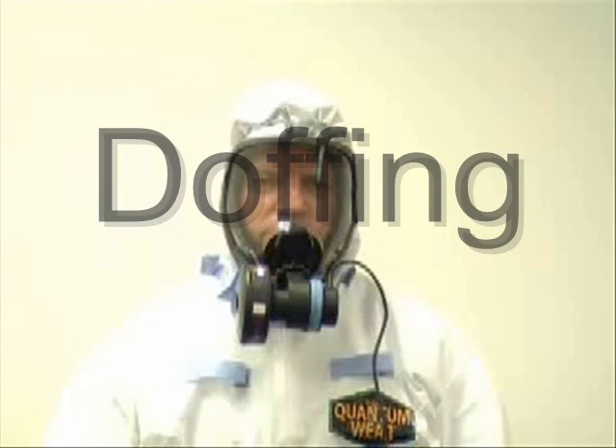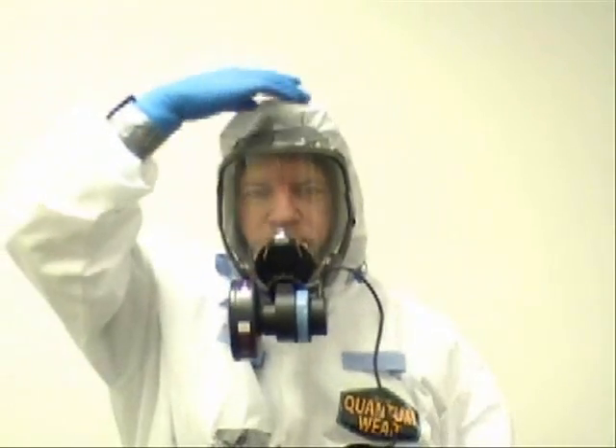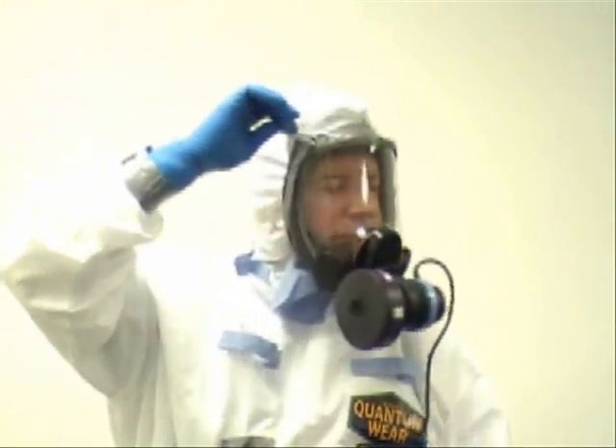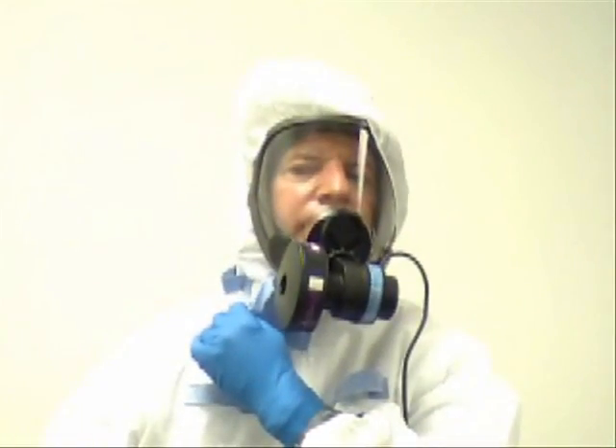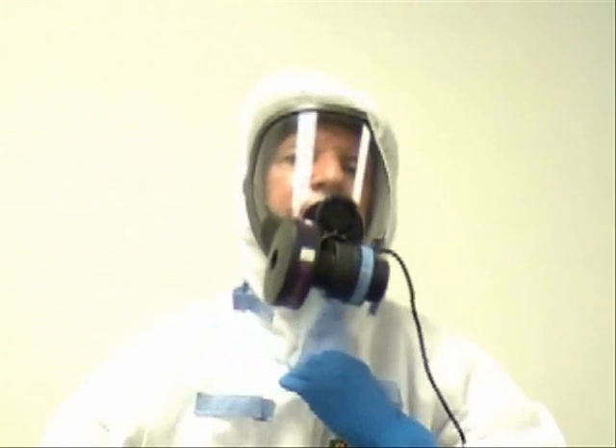Instructions for doffing the Q-Guard Quantum Wear Suit: To doff the suit, remove the two pieces of tape used to create a sealed closure between the respirator and hood. Then release the velcro flap, which has an extended flap to reduce the chance of contaminated particles from the user making contact between the exposed neck and gloves.